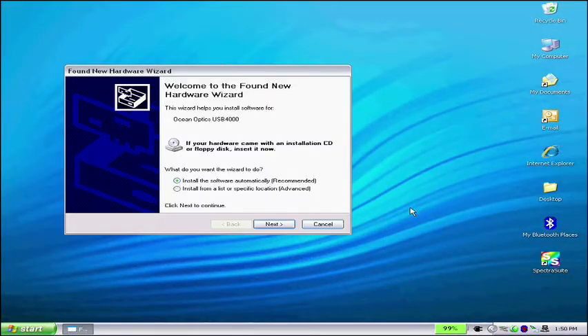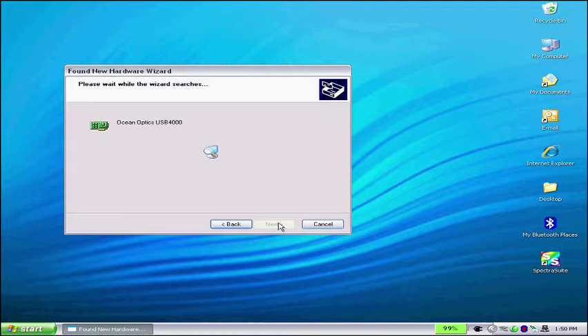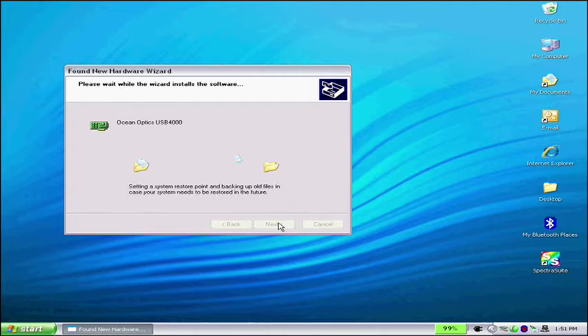You will see a Found New Hardware message. If you are asked to connect to the internet to find drivers, click on the Not at this time option. Instead, select the option for finding drivers automatically. The computer will now find the drivers from your CD and alert you that your Spectrometer is ready to use.